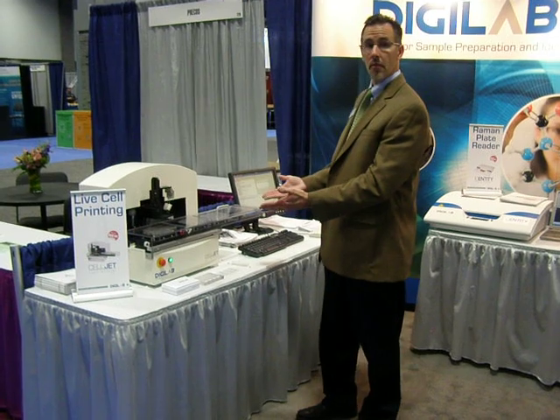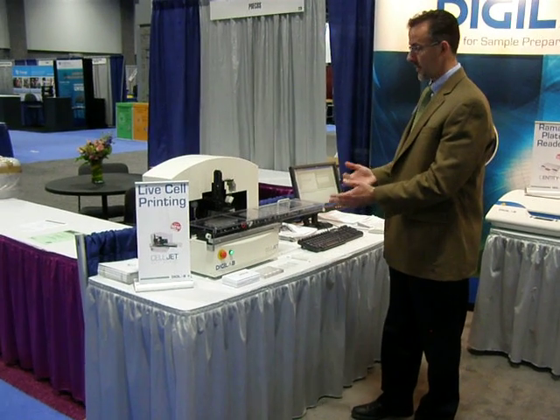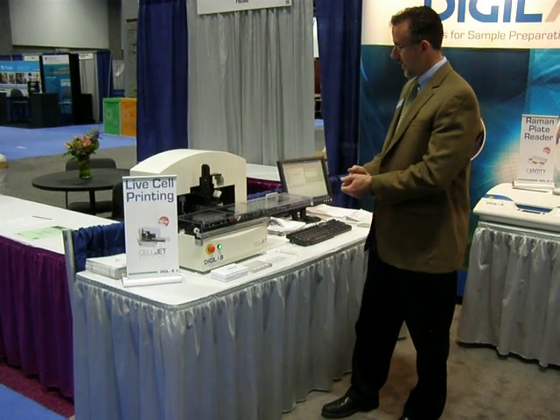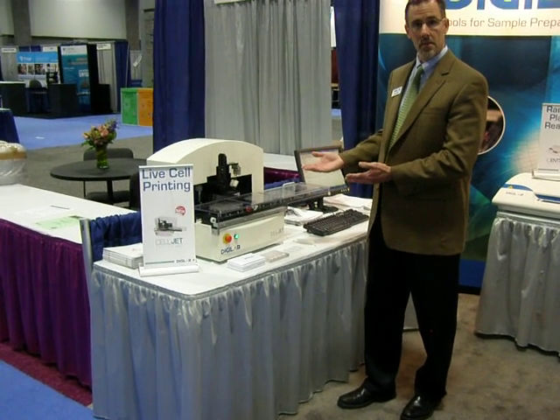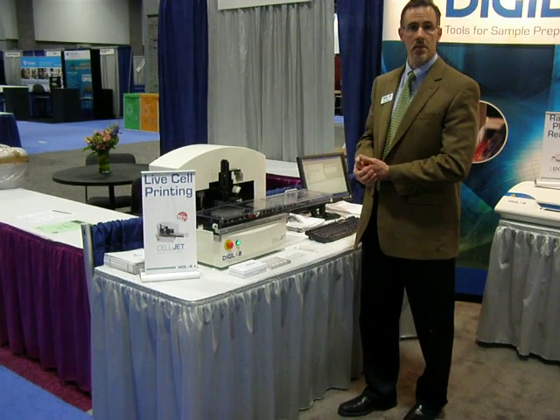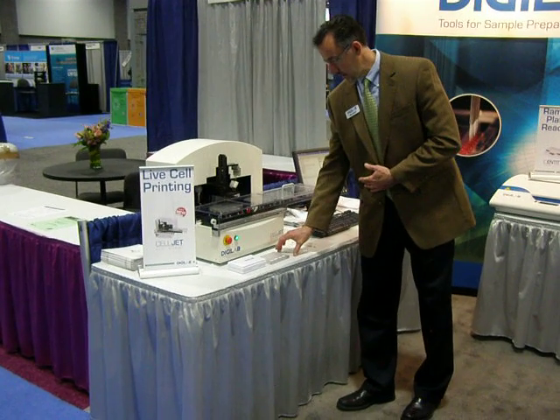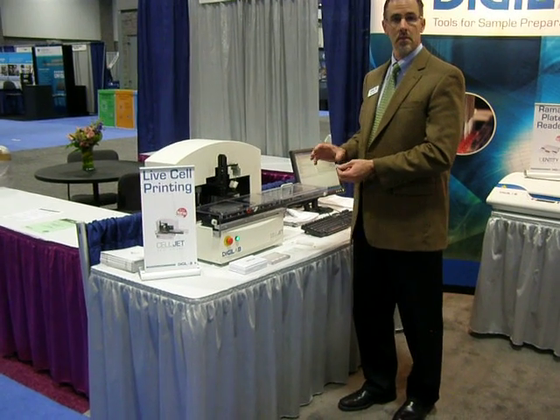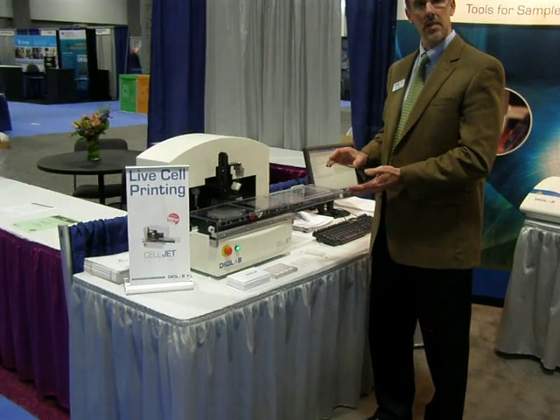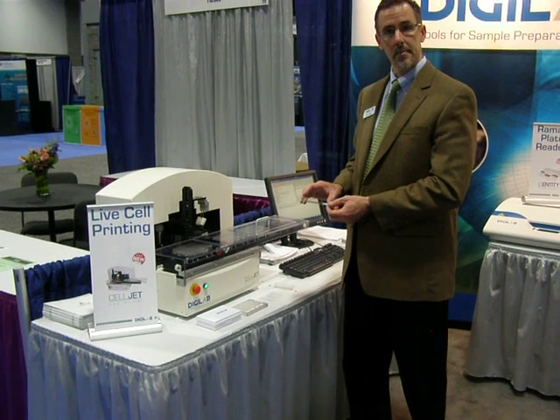You can see the device has a very small footprint. It's very flexible and easy to use. It has the ability to dispense onto microtitre plates of any number of wells, from 24 to 1536 wells. It also has the ability to dispense onto microscope slides and other substrates, so very flexible in terms of what it can dispense onto.